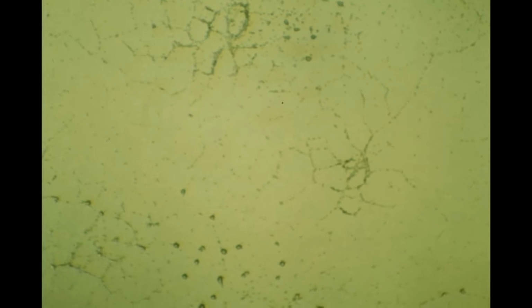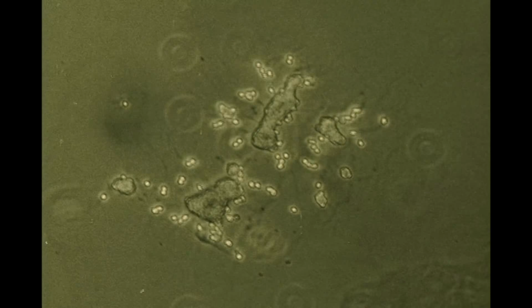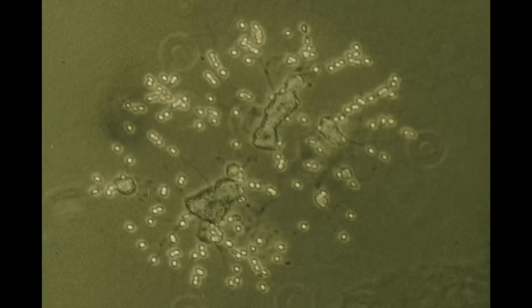This low magnification scene scans an expanding colony in which the action has been speeded up 2,000 times. In the older parts of the colony, cells are aggregating prior to the formation of resting structures or cysts. When the cysts are placed onto fresh nutrient medium, the cells become active once again.